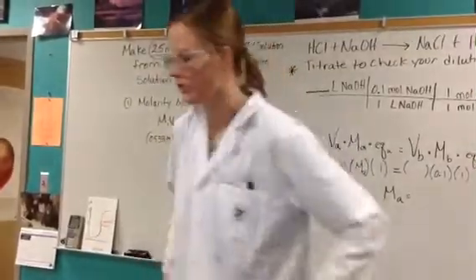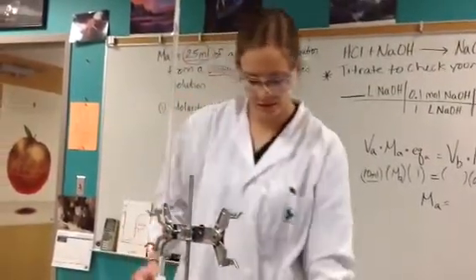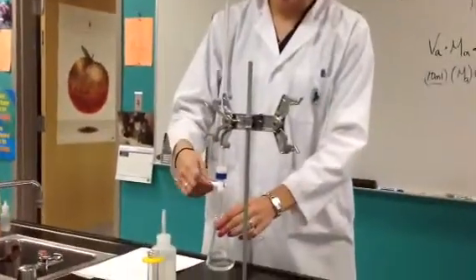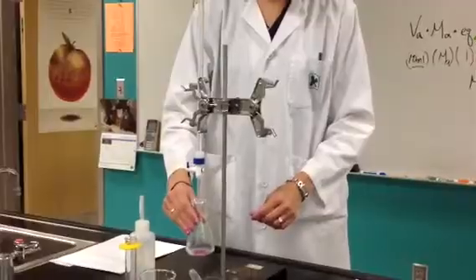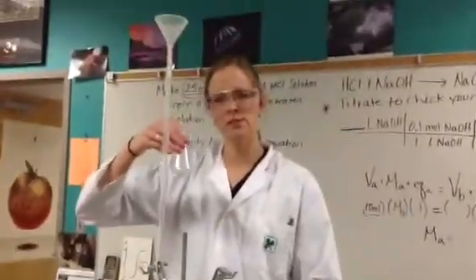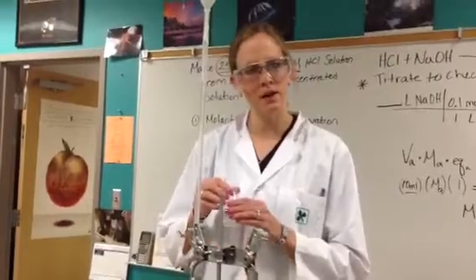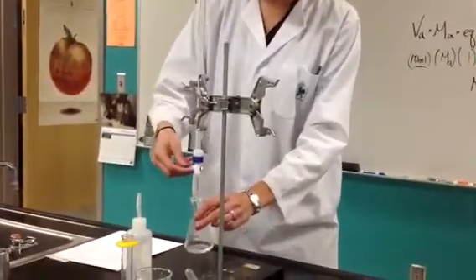Now I've got my phenolphthalein in and I'm going to do a titration to check that I've done my dilution concentration correctly. Record your start value of the base, then begin your titration — it's the drop and swirl, just like you did with the monoprotic and diprotic, so you should be pretty good at this. The pink is starting to stick around a little longer. I recommend taking your Erlenmeyer flask out from underneath your burette when you swirl, so you don't break equipment. Once the pink sticks around a bit longer, go drop by drop.